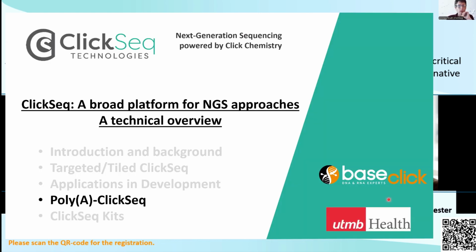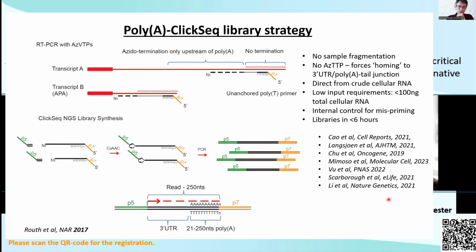Okay. So I'm very briefly going to describe polyadenylation, which Eric Wagner will talk about in more detail, so I don't want to belabor the point too much. But in the same way that we can use primers to target a region of interest, we can also use primers to target the poly-A tail of messenger RNAs. And there'll be one poly-A tail for the end of every messenger RNA.